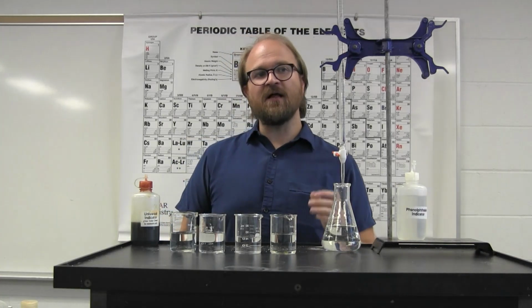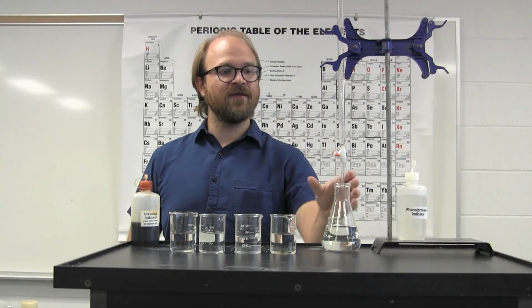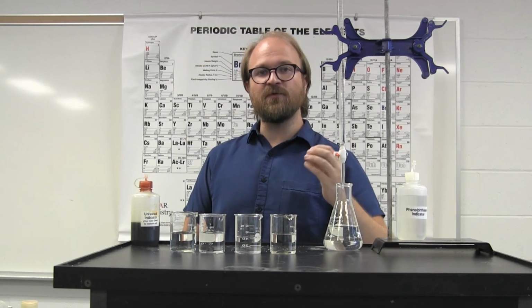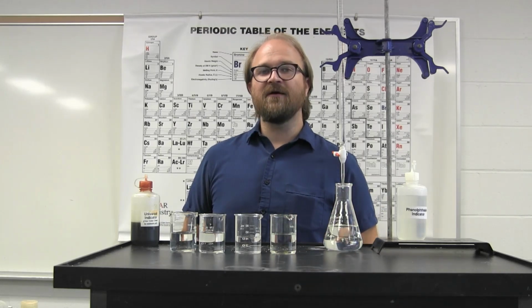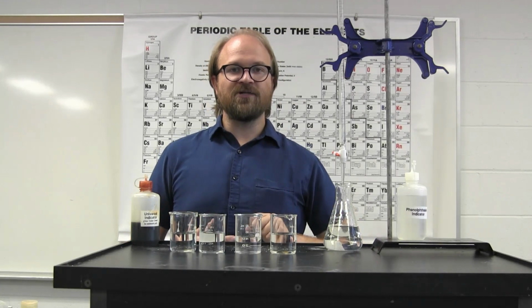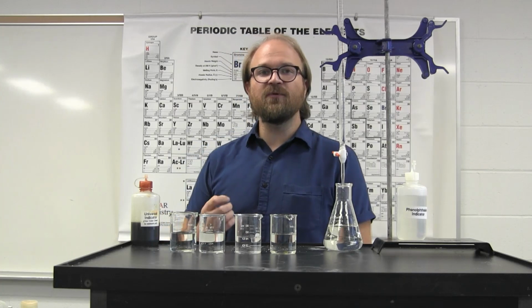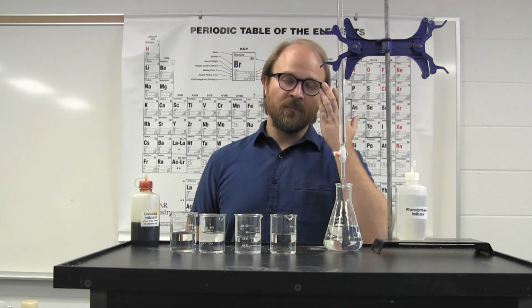The reaction itself uses a burette, which is a device that can very accurately add specific volumes, and you can measure the exact amount of volume that you add. Doing so is a titration. This reaction and the one in the simulation, as well as many others, use indicators to visually show when a reaction is complete or not.